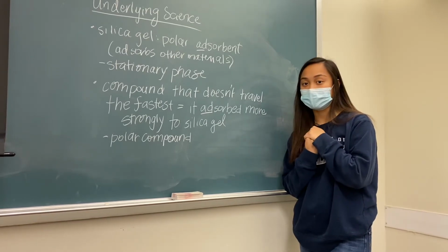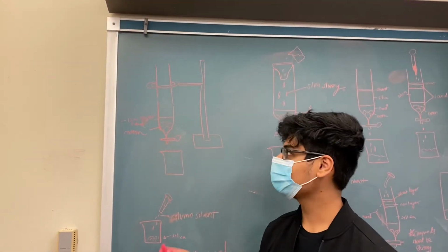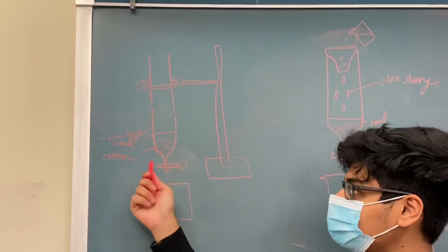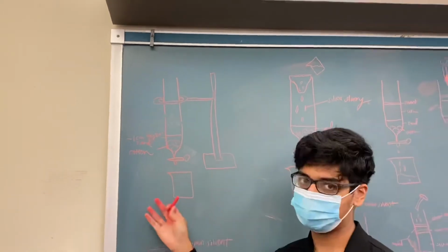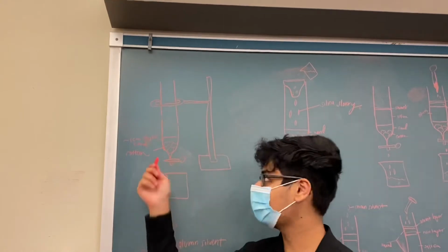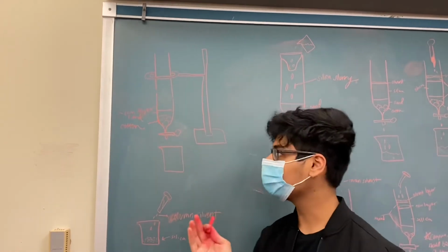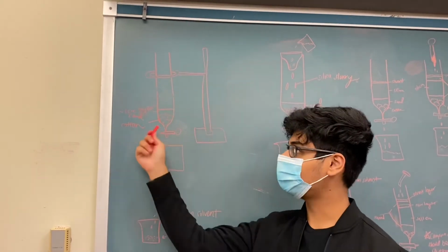So now Josh is going to take you through a general procedure for silica column purification. Okay, to start, first we're going to need a reaction column, stopcock, a beaker, and then a ring stand. You're going to attach the stopcock onto the reaction column and then support that by the ring stand, put a beaker underneath. Then you're going to put a little bit of cotton inside, not too much, but enough so it kind of covers and fits snugly inside the little curves inside the reaction column. After you put the cotton, add about a 1 centimeter layer of sand on top of it.